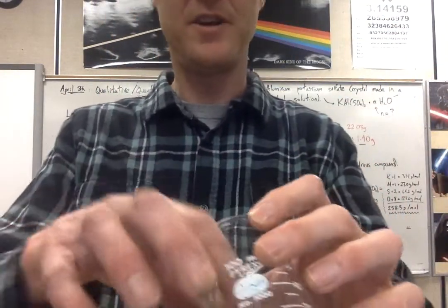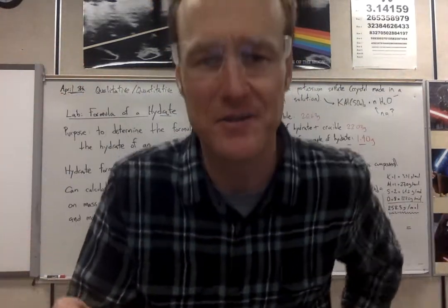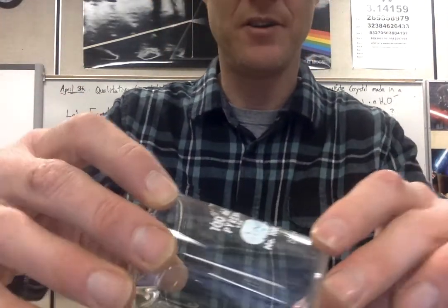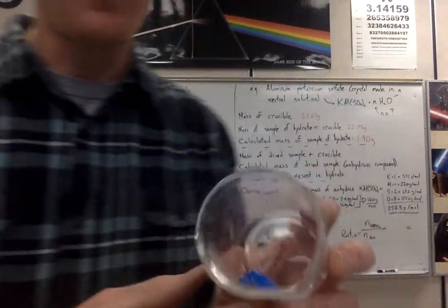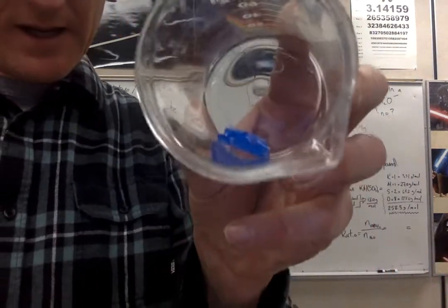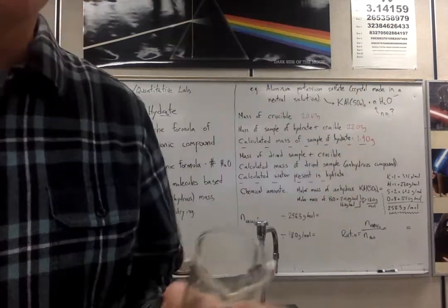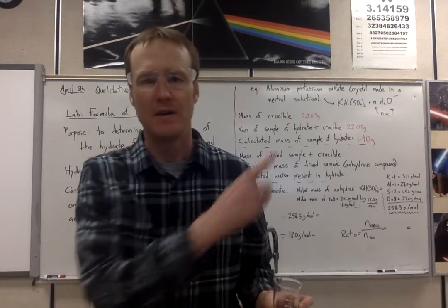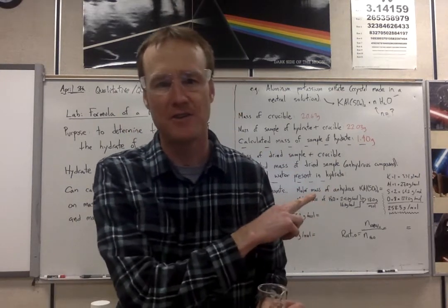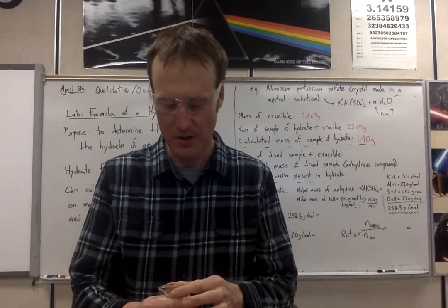So, can we say contamination? Here I am holding this thing for you. You can think of all kinds of sources of error, I'll bet, based on the way I just picked that thing up. Here is a crystal of copper sulfate. This will be the subject of your lab. All I'm going to give you will be the raw data. Here I'm going to show you the answer. For this one, I'll be relying on you to find the answer yourself based on my walking you through it.